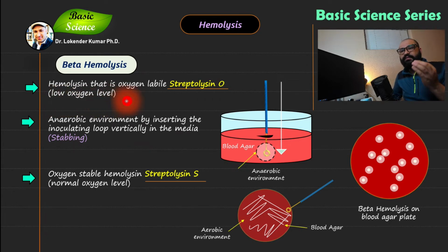I will say not a fully anaerobic environment, but maybe an incomplete anaerobic environmental condition. You can provide this condition by using the stabbing method.